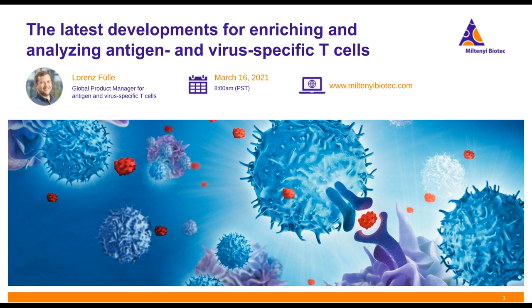Yeah, so this is also a very good question that we often get. So for the analysis of antigen-specific activation, be it CD4 or CD8 positive T cells, you always need antigen-presenting cells that will actually present the peptide. So in this case, the peptivator.